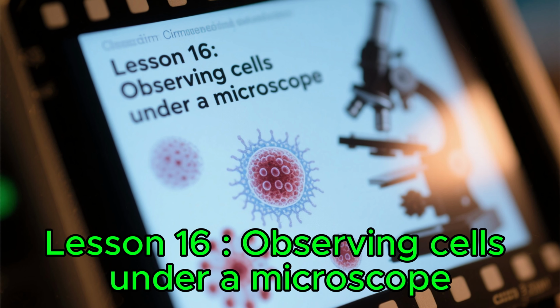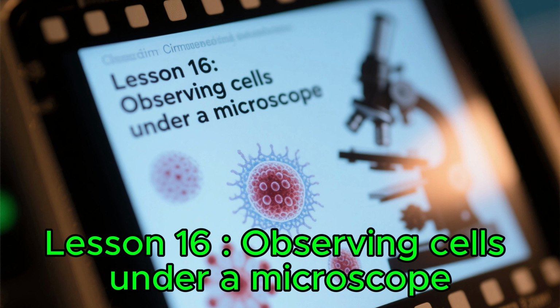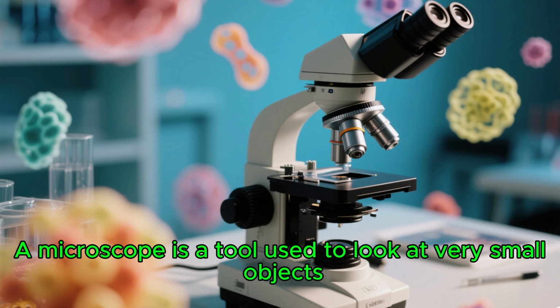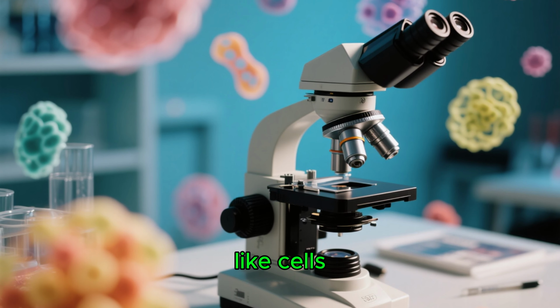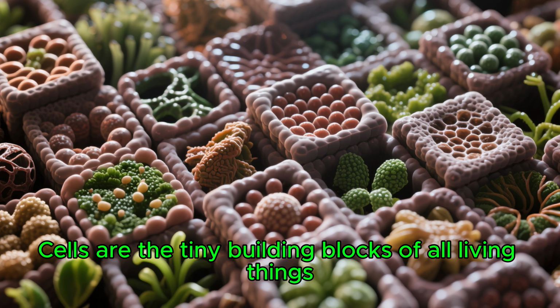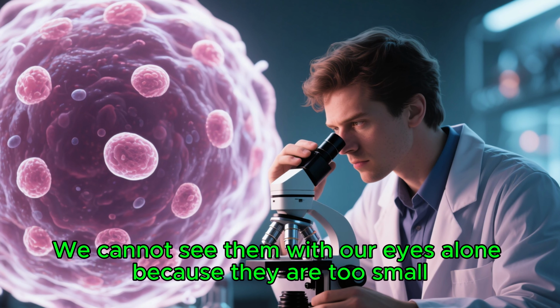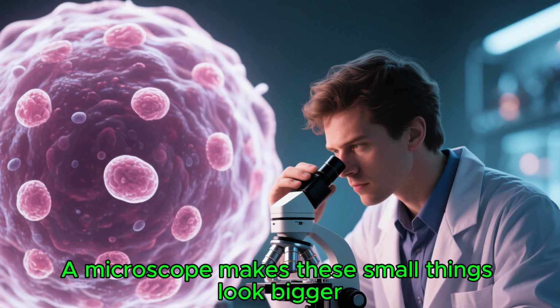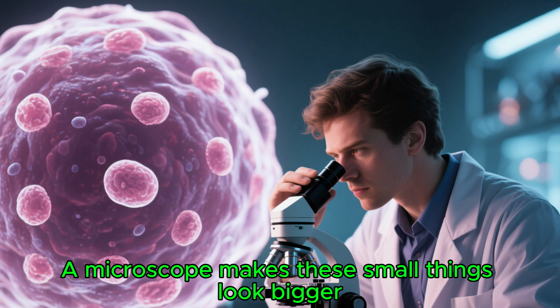Lesson 16, Observing Cells Under a Microscope. Introduction. A microscope is a tool used to look at very small objects, like cells. Cells are the tiny building blocks of all living things. We cannot see them with our eyes alone because they are too small. A microscope makes these small things look bigger.